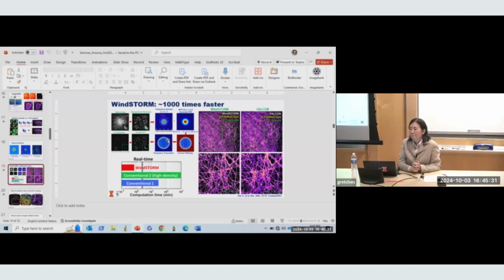Any other questions, folks? I have a quick question. For your mesoscale microscope, can you also do single molecule microscopy with it? It's a great question. The challenge there is that it relies on the photon counts, right? We had some idea of using some kind of photonic chip.